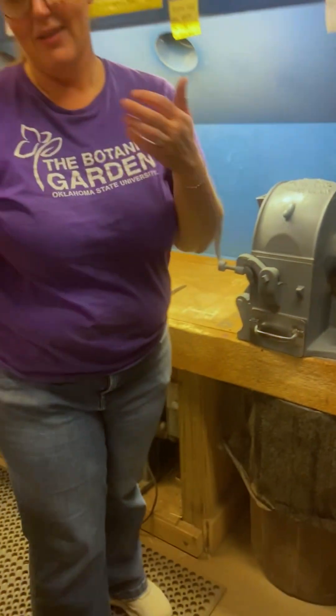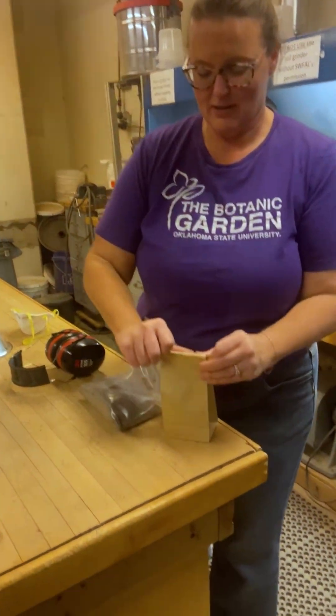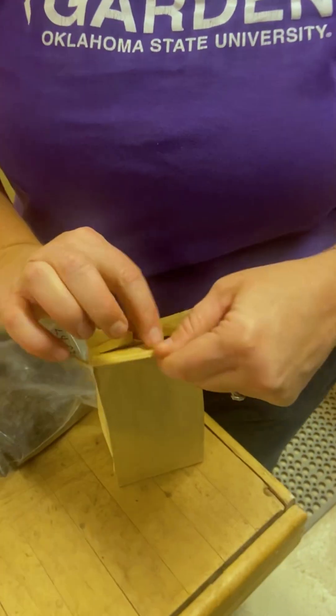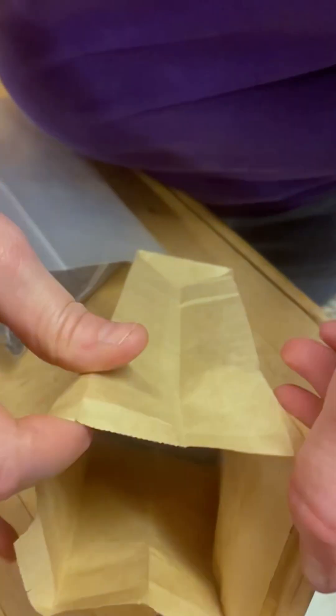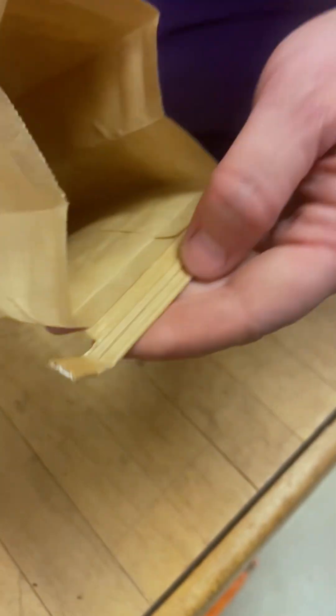We're going to pull that out and I'll show you what it looks like when it comes out. It looks like coffee grounds. This one's a really sandy sample, but you can see how fine that texture is.